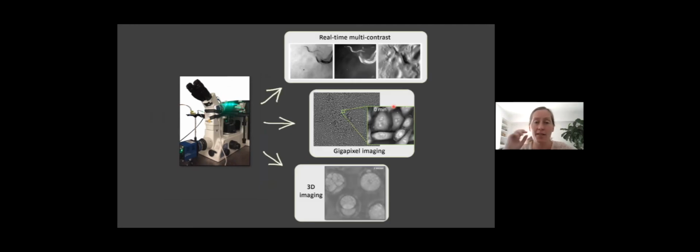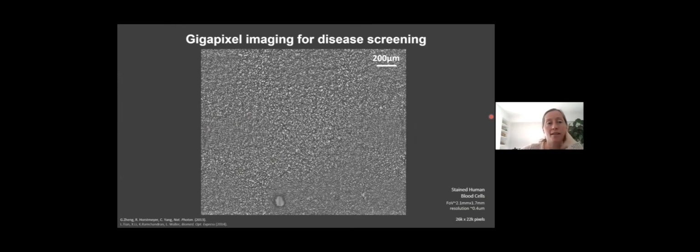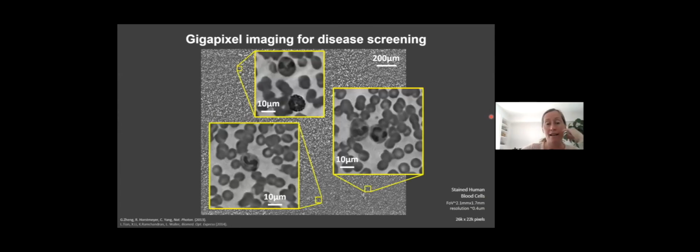Well, actually, it turns out that this is a really neat hardware platform for computational microscopy. And by choosing different illumination patterns and using different reconstruction algorithms, you can get all kinds of different imaging modalities out of this single hardware system with no moving parts. I'm not going to get into it much. The reason we built this was to do this Fourier ptychography idea, or gigapixel imaging, which is just another name for it, because it's all about going after a really big field of view while also having high resolution. And normally you don't get both.